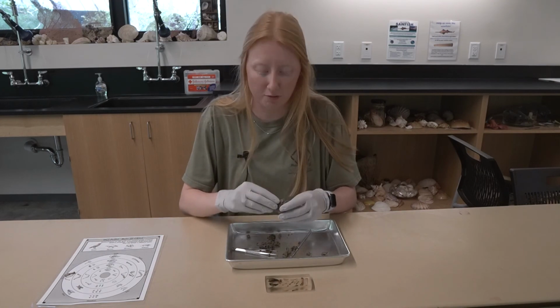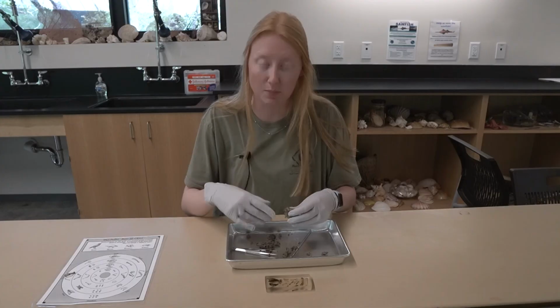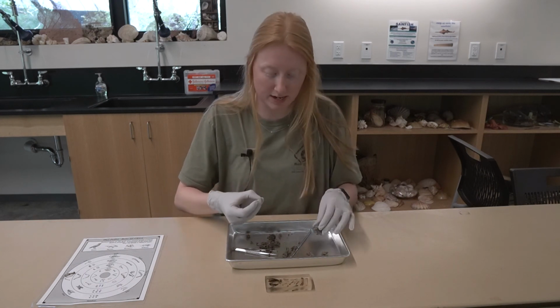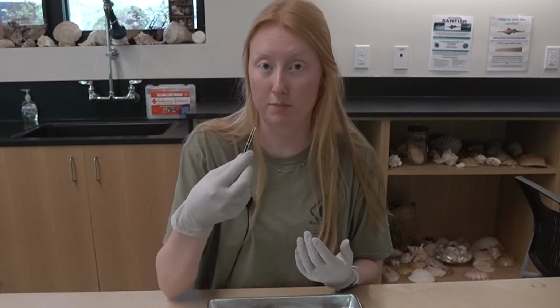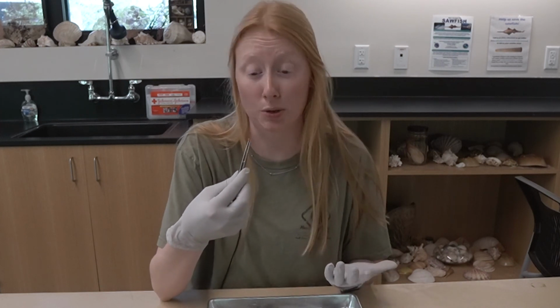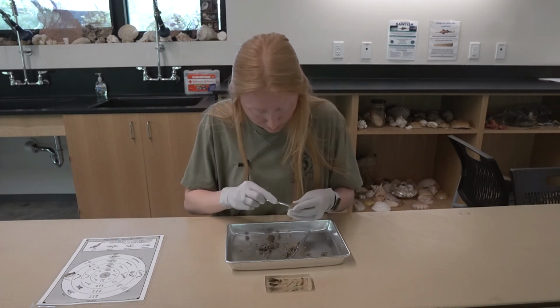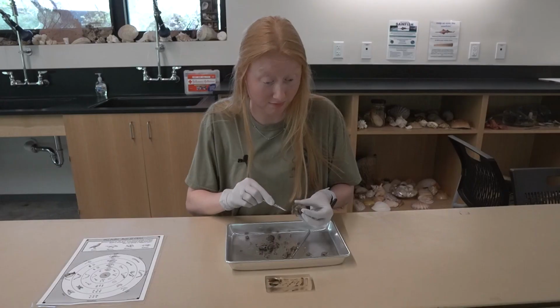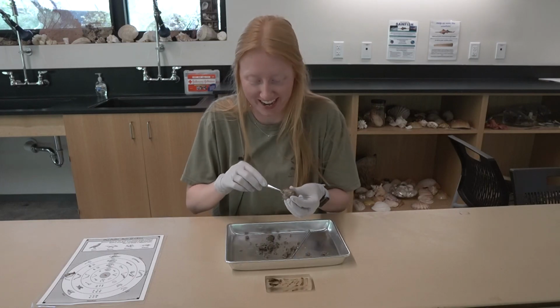You also have to try and be very careful because sometimes bones can be very, very brittle. And so if you want to try and preserve something as much as possible, try and get it completely out of the fur, out of the pellet intact. So for example, let me pick it up with the tweezers. This tooth just kind of broke off from the rest of the skull, but it's orange. It's obvious that it came from a rodent and it's pretty big for a mouse or a rat. Well, that happened. It just comes with the territory, I guess.